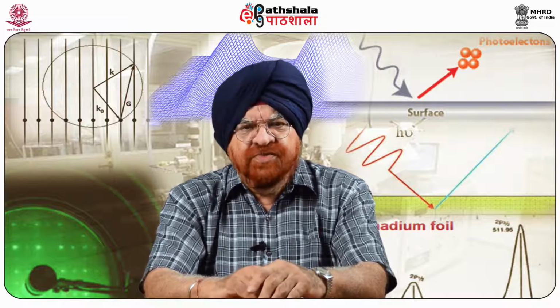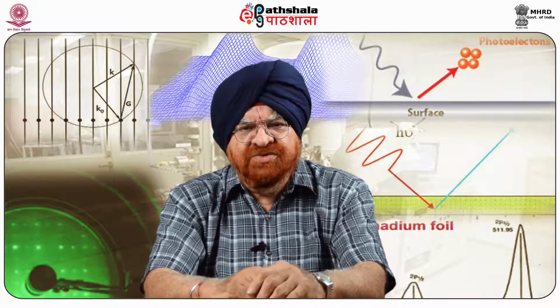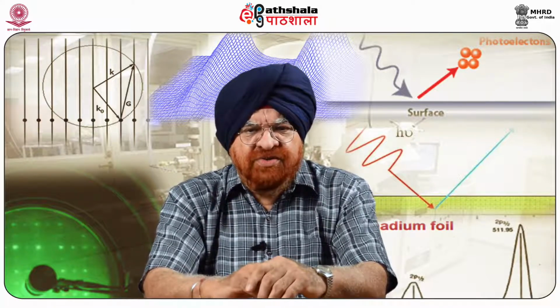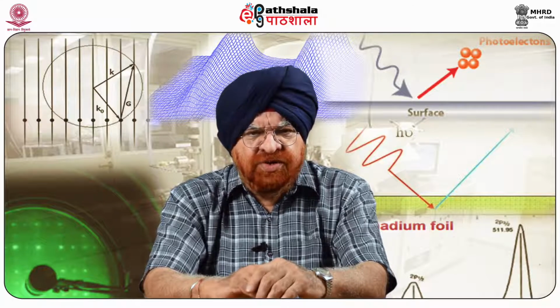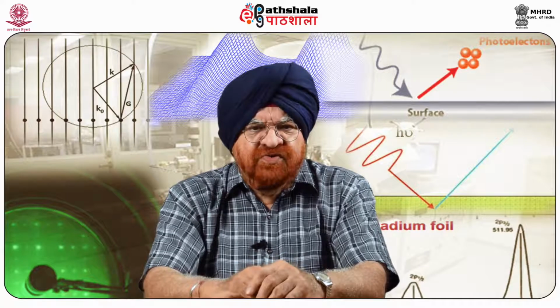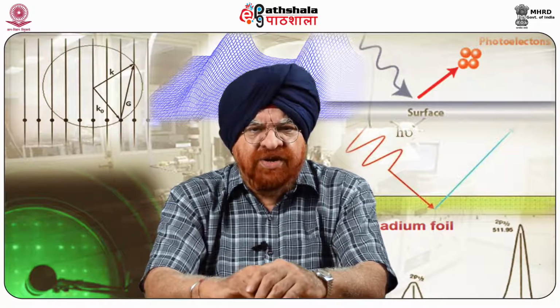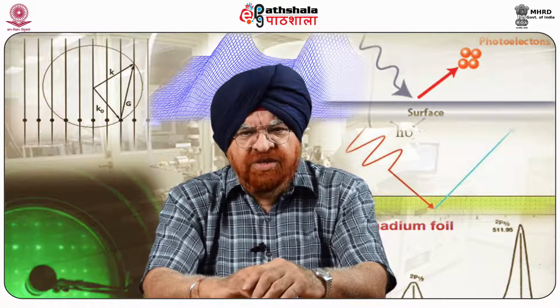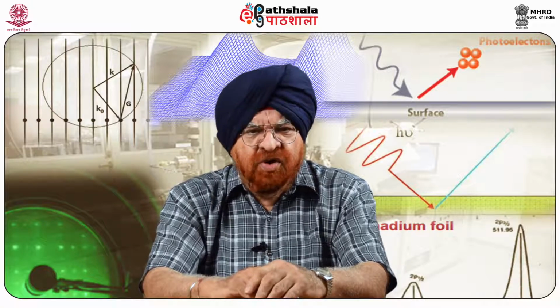We also have these in electrochemical systems primarily. So electrochemical reactions occur in electrolytic solutions, and in the interfaces we use this. For electroplating or etching, as we know, or batteries for that matter, we use this very effectively.